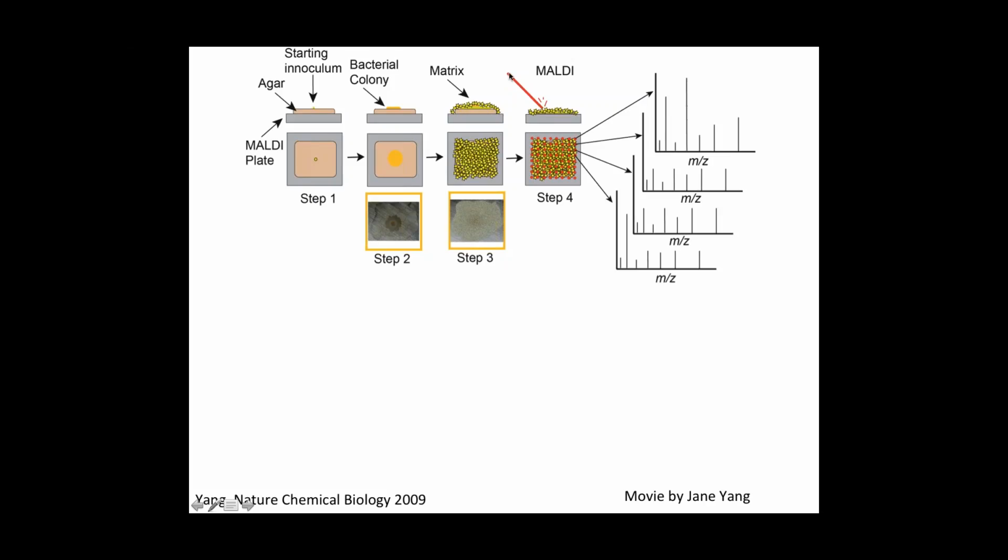And here I show a MALDI setup, so you hit it with the laser, but you could also do DESI or nano-DESI type approaches. But you raster across your sample. You collect individual spectra at each one of these locations. And then if you're interested in a specific ion, so let's say this green ion, if that's observed in that pixel, you would color that green. If a neighboring pixel has that same ion in there, you would color that green as well.